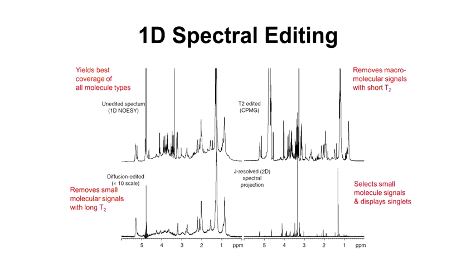So we've talked about improving the speed with the idea of automated deconvolution, kits if you want, more rapid 1D and 2D acquisitions. We talked about sensitivity enhancements using better magnets, better technology, or DNP. There's also ways of simplifying NMR spectra. If you can simplify NMR spectra, that also improves the speed and the accuracy in which you can do spectral deconvolution. So there have been a number of ideas floating around.